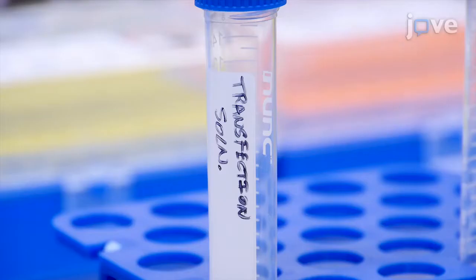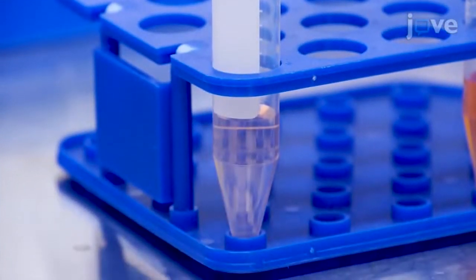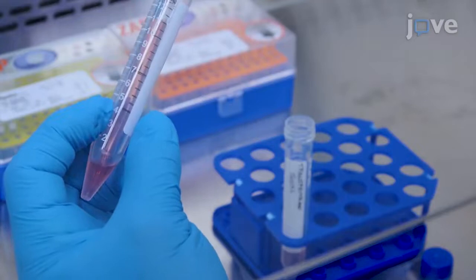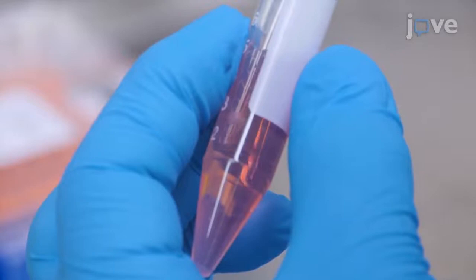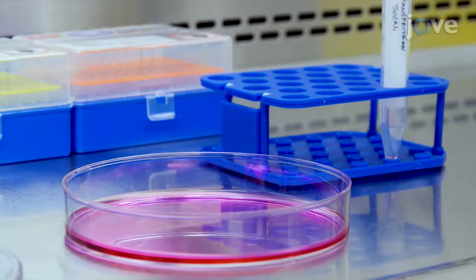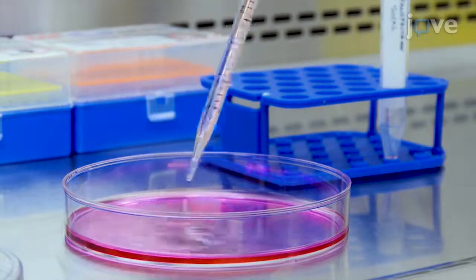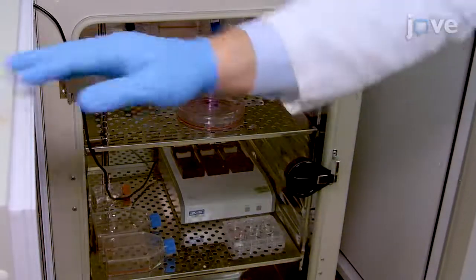The next morning, mix 2.5 milliliters of transfection dilution solution supplemented with 5 micrograms of lentiviral vector plasmid DNA and 22.5 micrograms of lentiviral packaging mix with 82.5 microliters of transfection reagent in 2.5 milliliters of transfection dilution solution. After a 15-minute incubation at room temperature, transfer the reaction dropwise into the dish of HEK293 FT cells and return the cells to the incubator for a second overnight incubation.